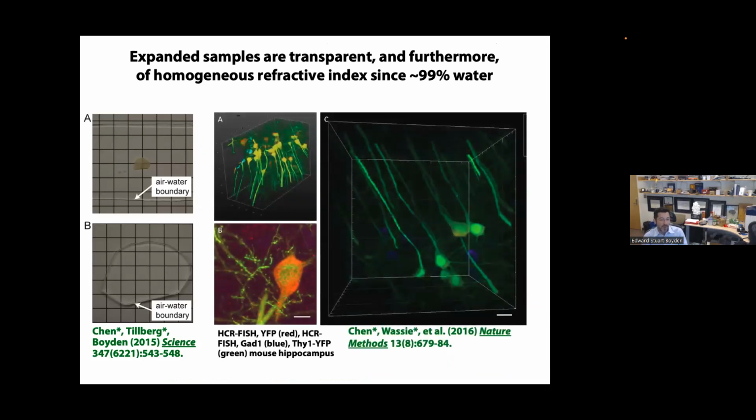So there's a trick called light sheet microscopy, where you shine light from one angle, and you take pictures from a 90-degree angle. And so every picture has a full 2D sheet through the specimen. You can go at very fast speeds because of this. And these microscopes are commercially available.